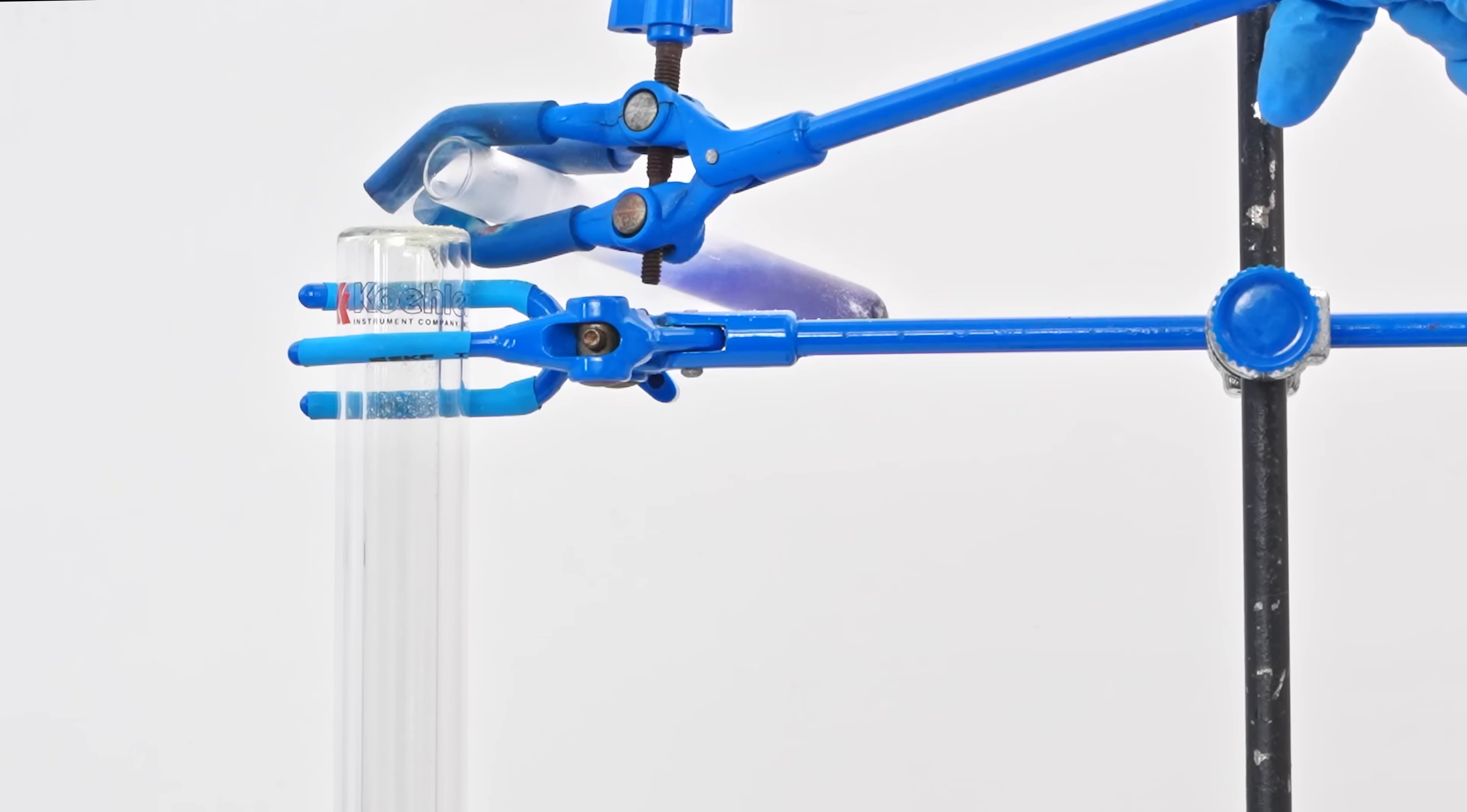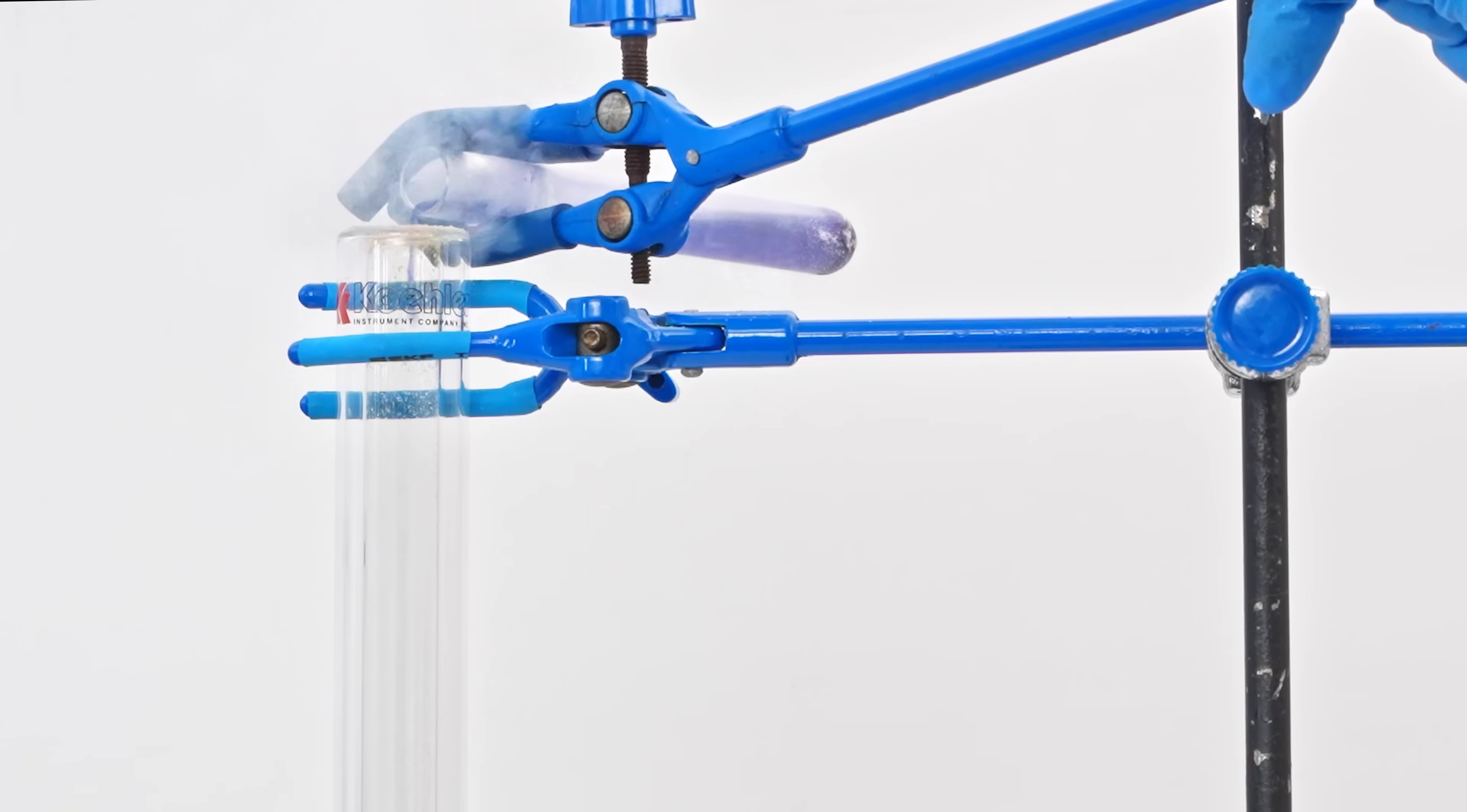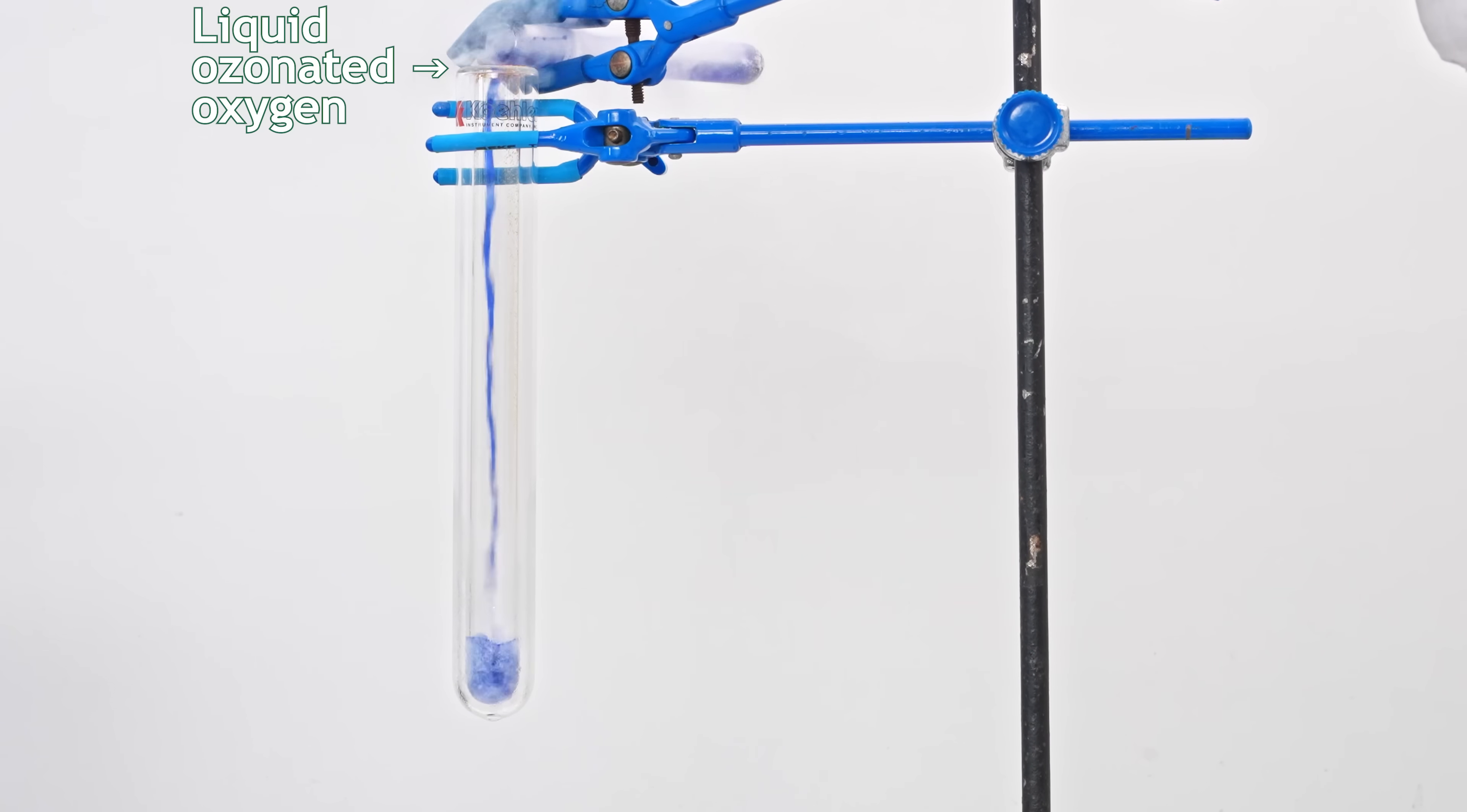For the next experiment, I wanted to concentrate ozone on potassium superoxide, so I used a Dewar test tube. I simply poured some potassium superoxide into the tube and added liquid ozonated oxygen.